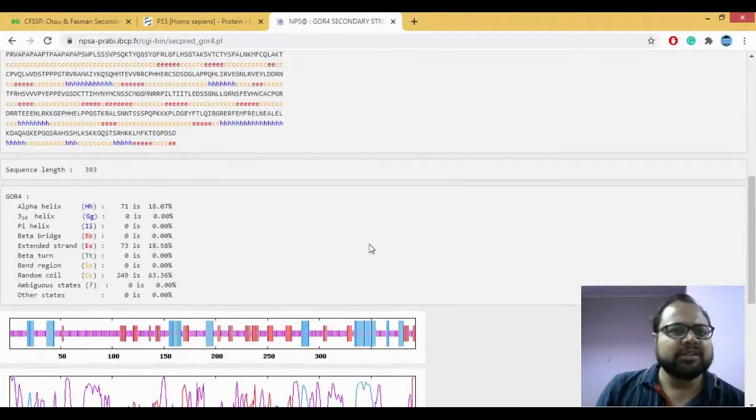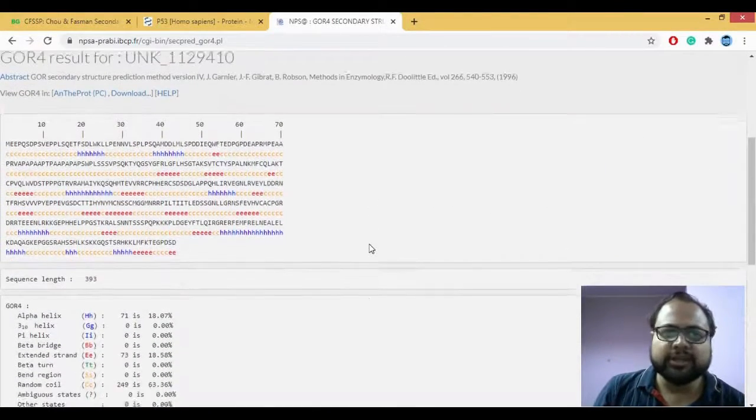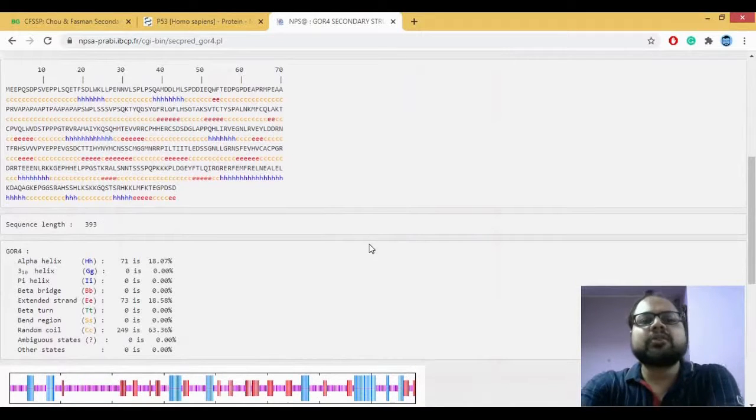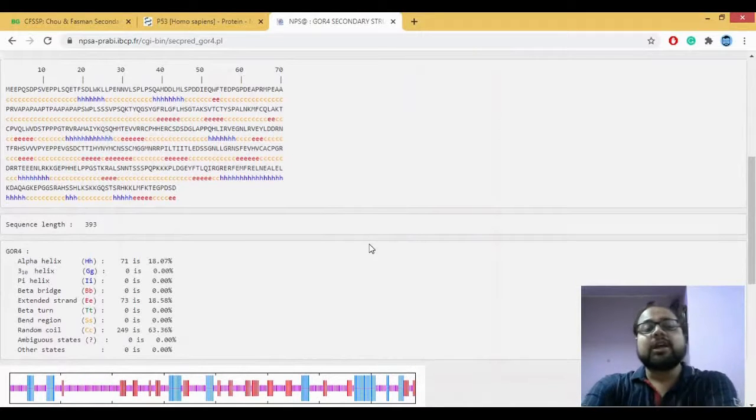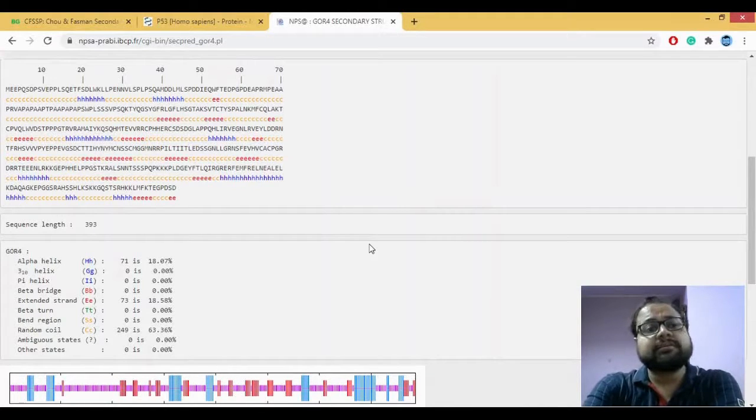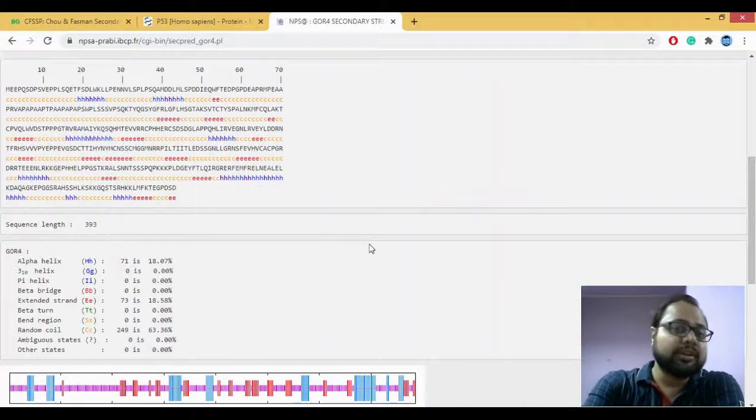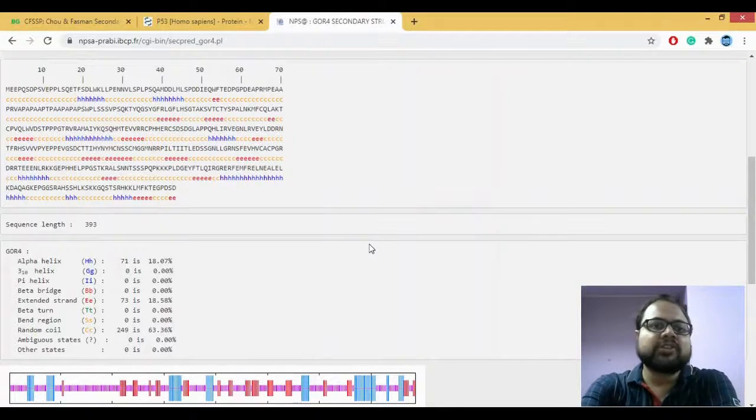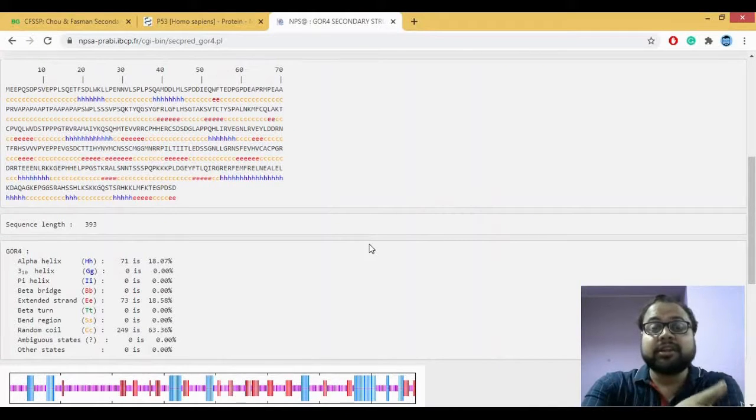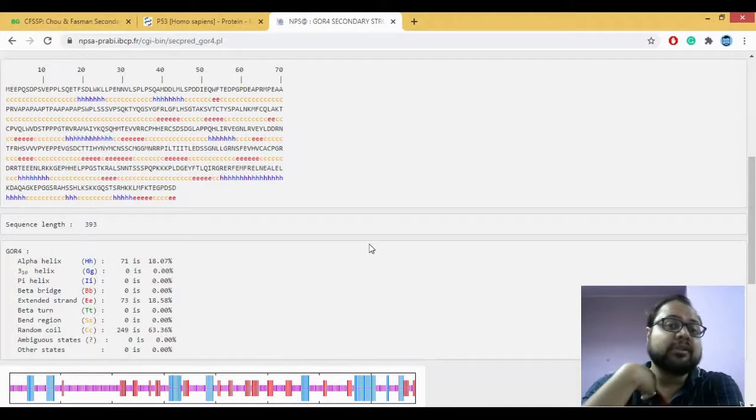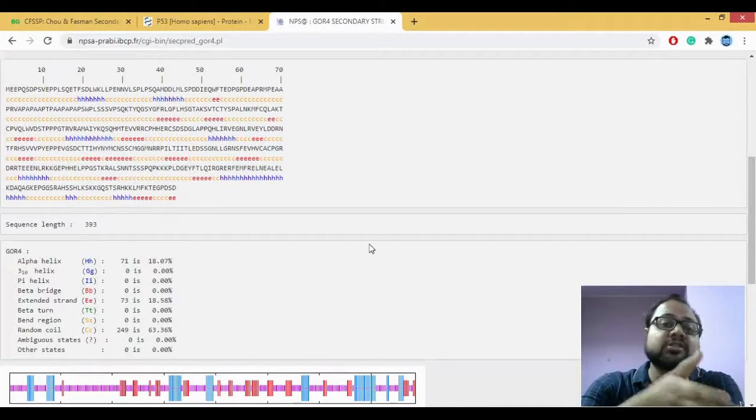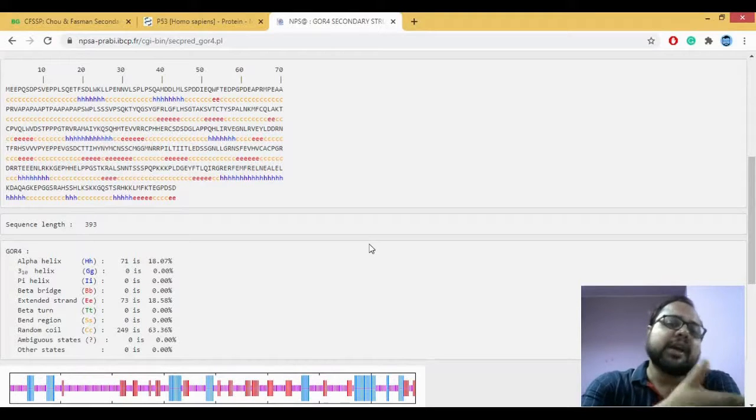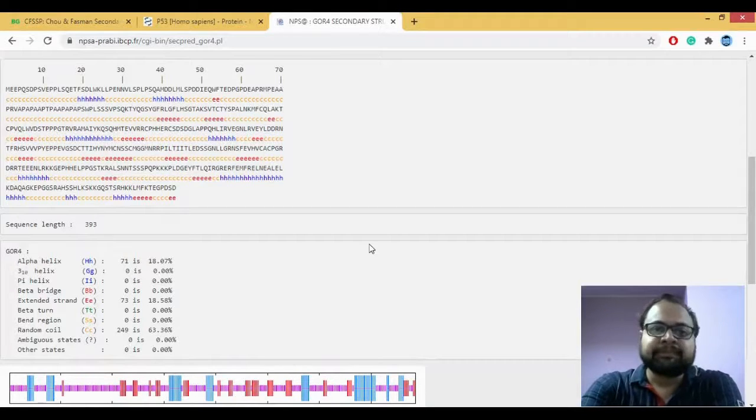So this is GOR method. As you can see, GOR gives you a much better and much detailed information about which are your various secondary structures, which helps us to predict your secondary structures in the protein in a much better way as compared to your Chao-Fasman.